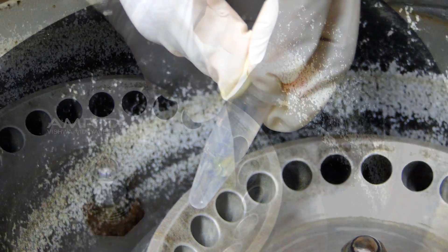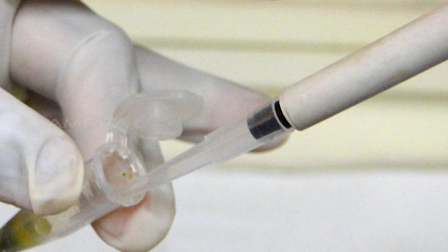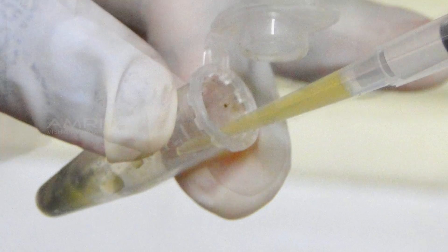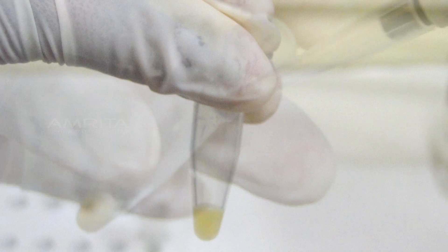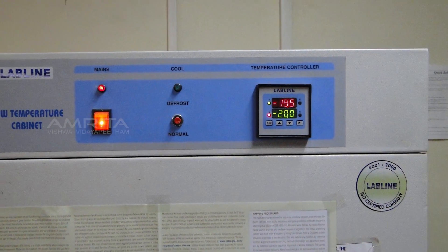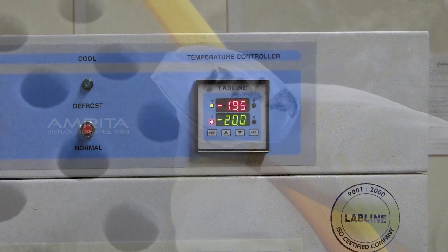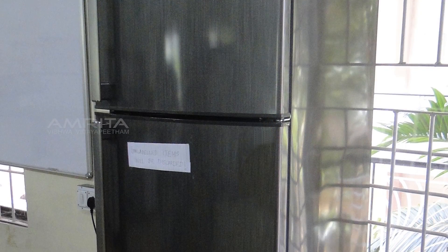Take out both vials from the centrifuge. Take a pipette and pipette out the supernatant from the vial. Transfer the supernatant into another vial. For long term storage, place the vial in a cryo box and keep it in a minus 20 degree Celsius freezer. For short term storage, place the cryo box with the vial and keep it in a 4 degree Celsius freezer.